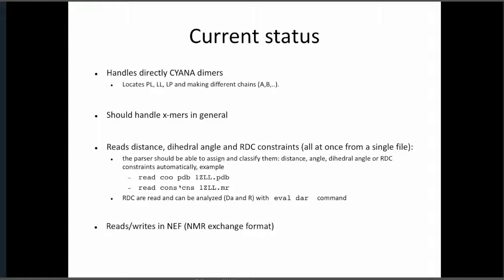Before I introduce you to this slide, I want to comment on one thing that I forgot. I realized just now. The other important feature that I can show you in the discussion coming later is that the PDBStat code is also able to calculate the NOE completeness based on whatever is published. It will read PDB coordinates, it will read some constraints in whatever format.